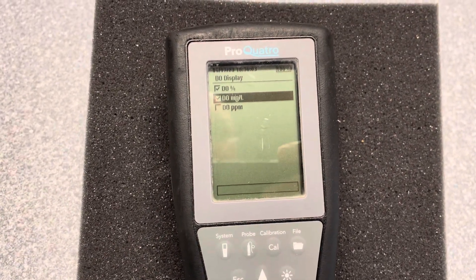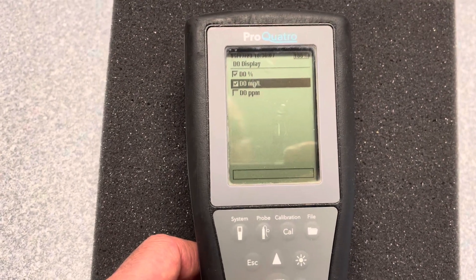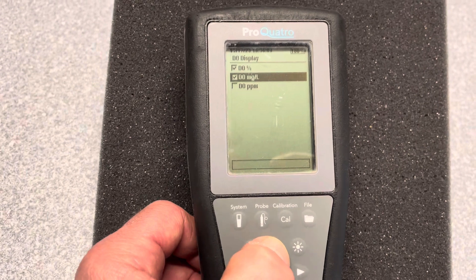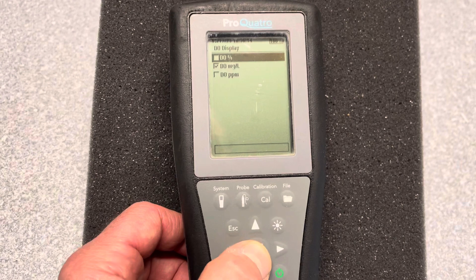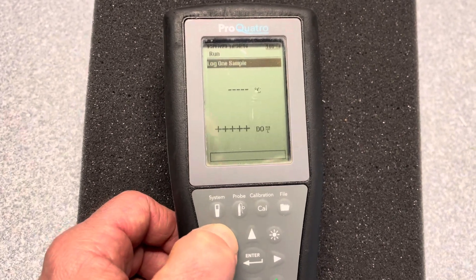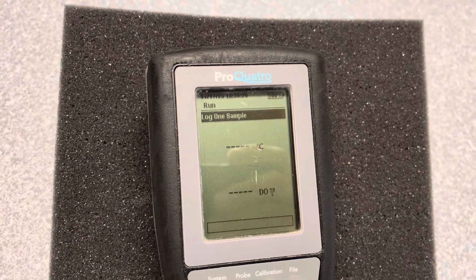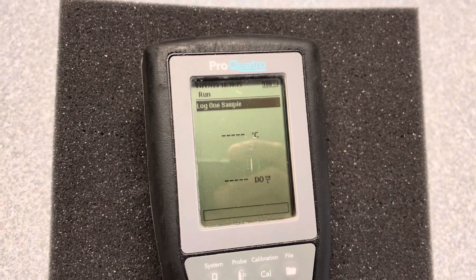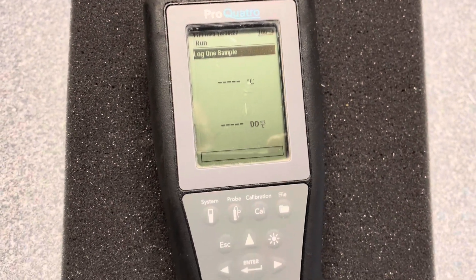The two that are highlighted are percent and milligrams per liter. If you want to just show milligrams per liter and you don't care about the percent, we're just going to go up and hit the Enter button, and then Escape. We can see that we turned off PH from our main screen, and we turned off DO percent — we're just left with milligrams per liter.